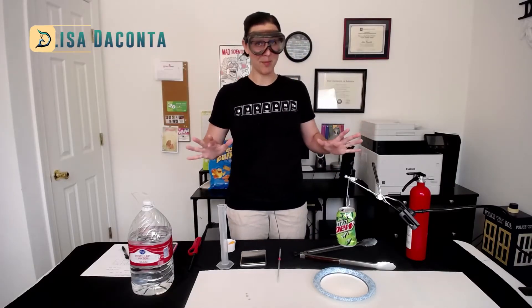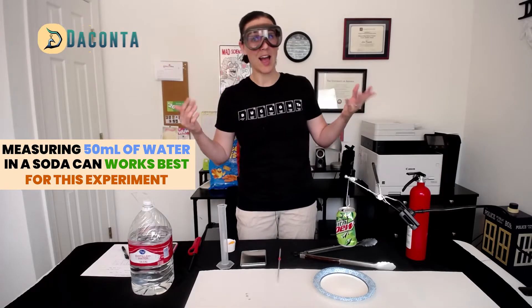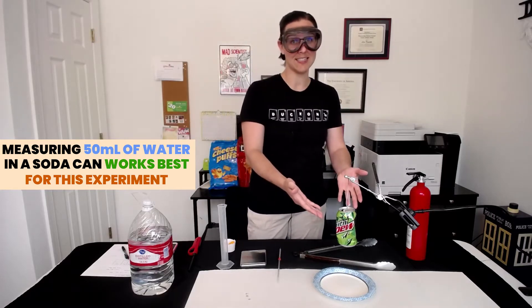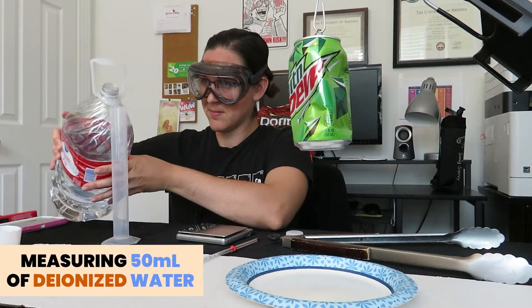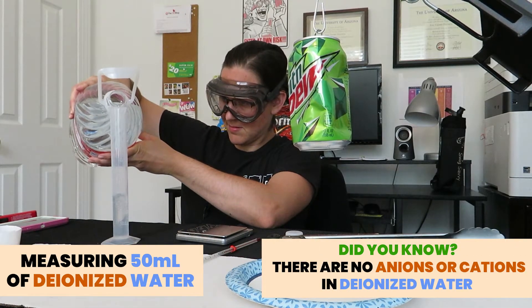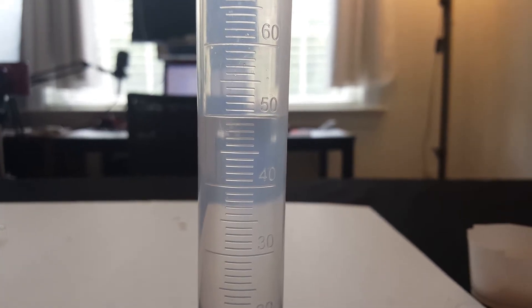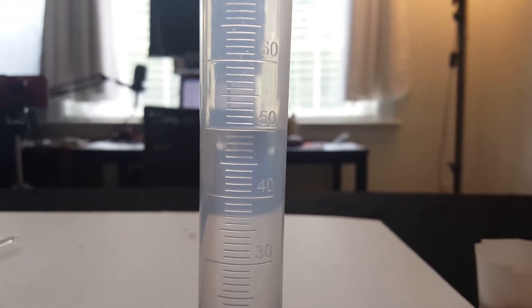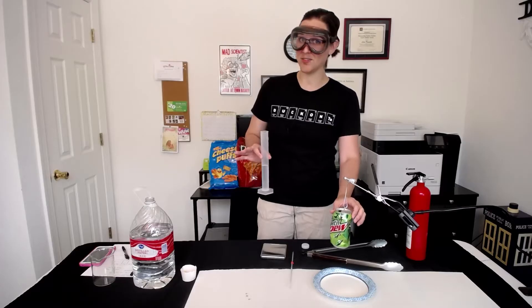For this makeshift calorimetry setup, we're going to need to measure out 50 milliliters of water. You could measure out a different amount, but I found that works really great in one of these cans. If you have an empty soda can, it's ideal to use for this lab because you can throw it out afterwards when it's all scorched on the bottom. So first, let's measure out 50 milliliters of deionized water. Make sure you're always getting down at eye level to see the meniscus of your water right at the 50-milliliter mark. Now we're going to take this 50 milliliters and pour it into our makeshift calorimeter.